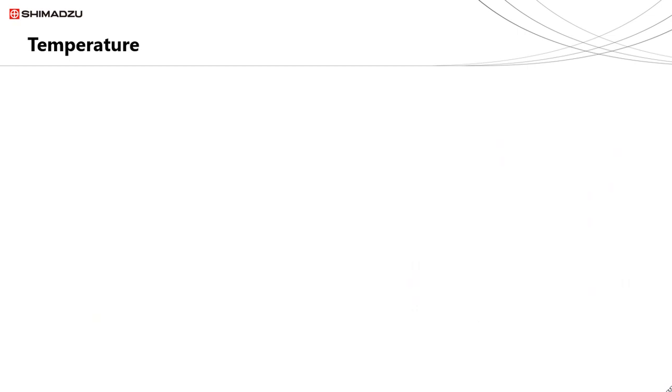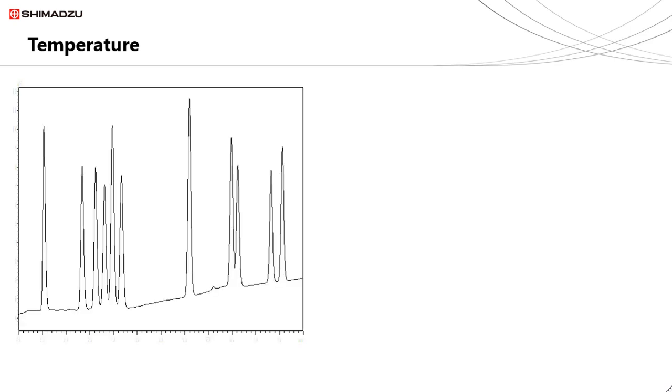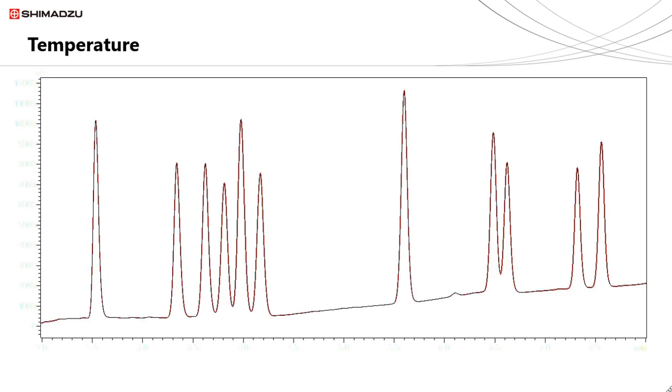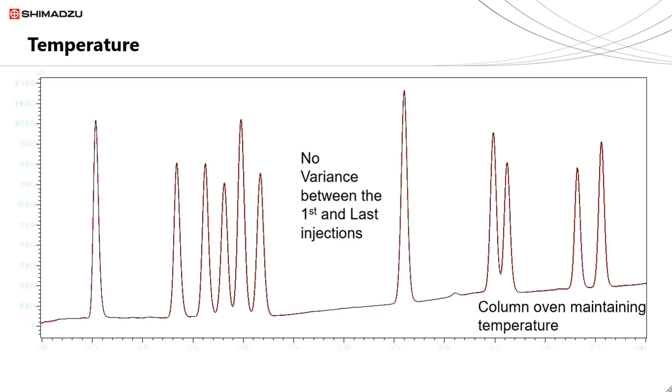Alternatively, within the same laboratory, we can use the same analysis using a column oven this time to negate those fluctuations in laboratory temperature. Therefore, taking samples run at the same time as we saw before, we can now look to see if these are the same. The result is chromatograms that are so similar that they look as if there is the presence of only one chromatogram, showing the increase in control using a column oven and a reduction of variance in our retention times.